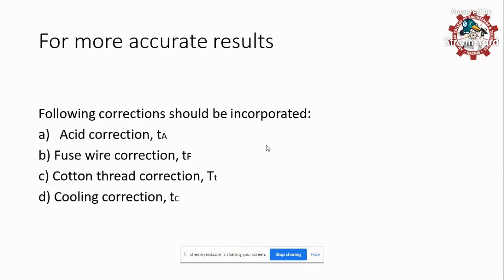If you remember the diagram I showed you earlier, in that we allowed all the byproducts to cool down to room temperature. That means stirring was done continuously for half an hour. So whatever gases were produced after the combustion were cooled. Agreed? So the total energy was taken up by the water. In the gross calorific value, we have so many things. One of the things added in the gross calorific value is the acid heat. Theoretically we need to remove it, but practically we added it already when we calculated GCV.